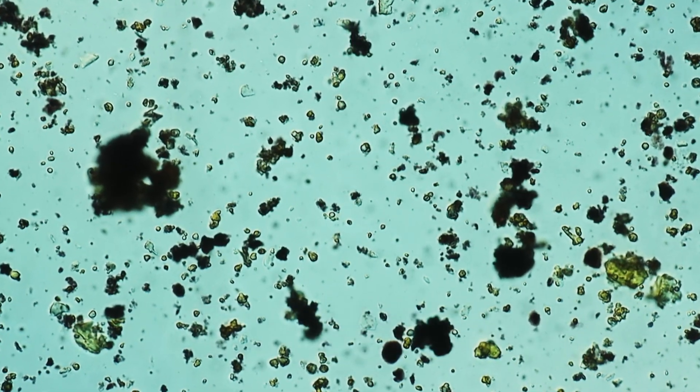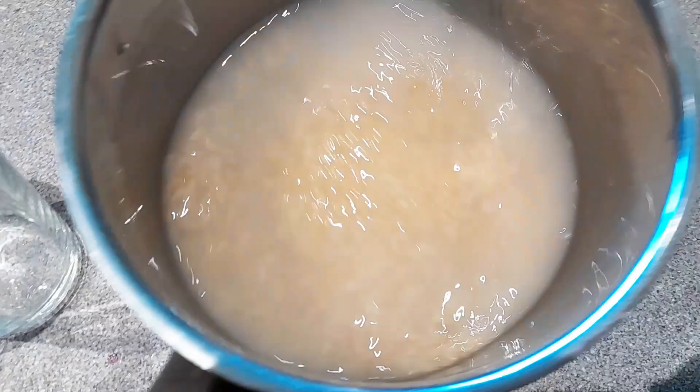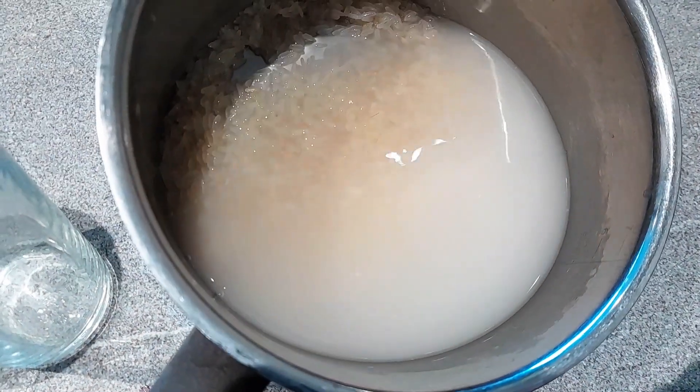I stained them with iodine and the iodine reacts with the starch and turns it black. That's basically what we're able to see here under the microscope.